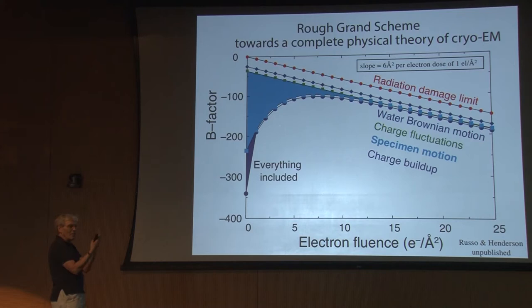Or the motion, the blurring, can also be removed in the computer. At the moment, people do motion correction of the movies that you can get with the new detectors. But at the beginning, the signal-to-noise ratio in the image and the algorithms are not altogether good enough. And the detectors also have what they call fixed pattern noise, which has nothing to do with the specimen, it's to do with defects in the detector. So basically, if all of these technical things are removed, it will be a lot better. But nobody's done it yet, so I think it's still for the future.